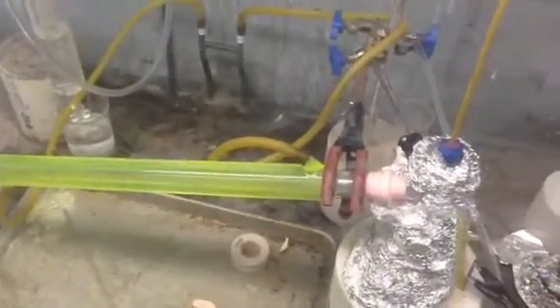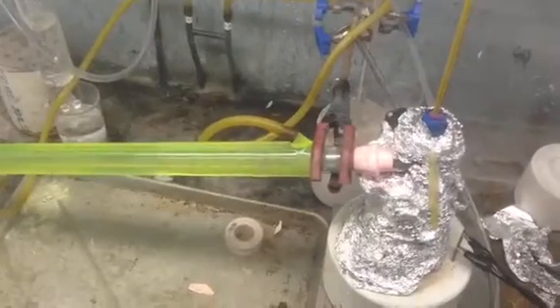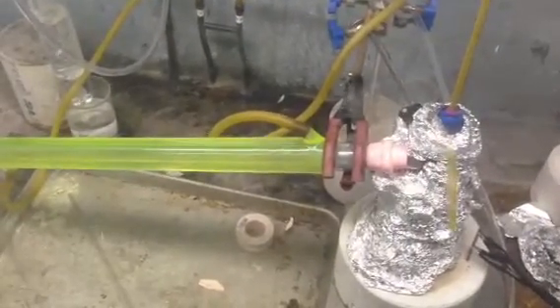It is pretty neat to see mercury vaporize and recondense. You will be able to see it run down the condenser there in a second. I will show you the boiling.